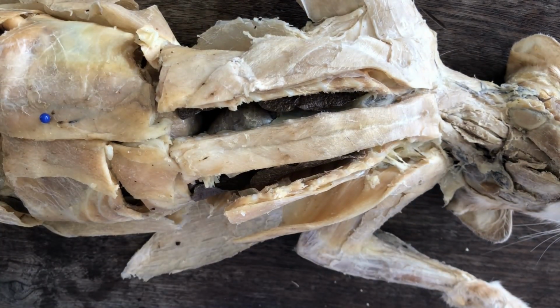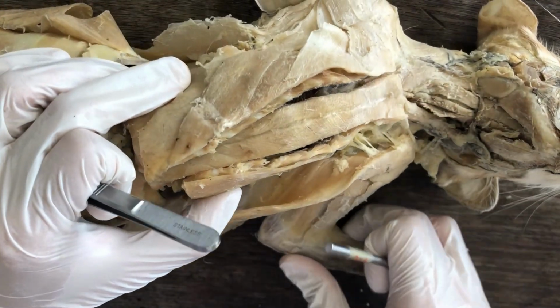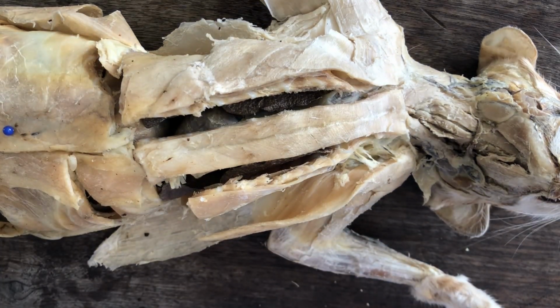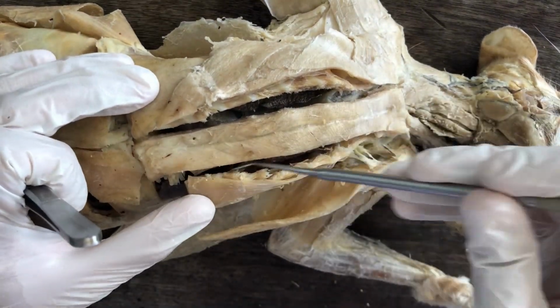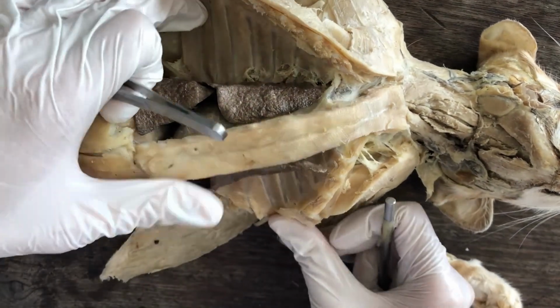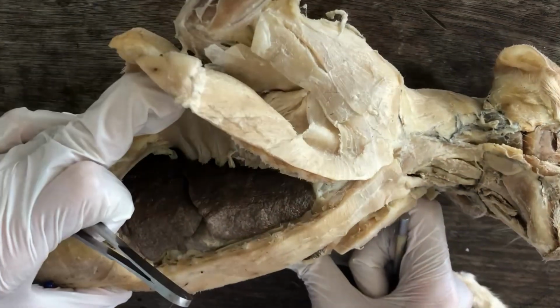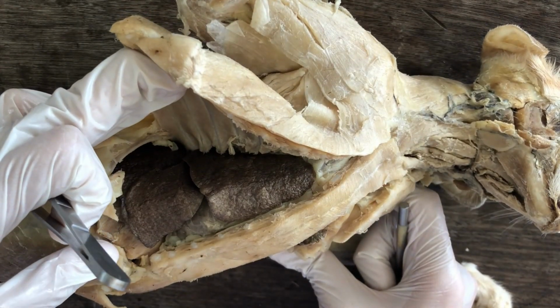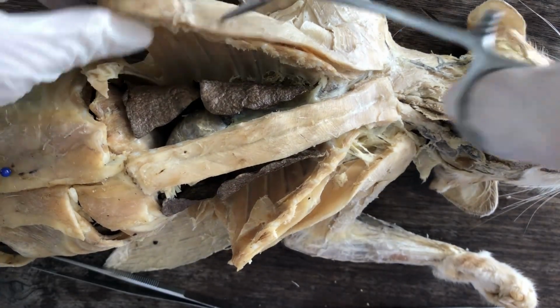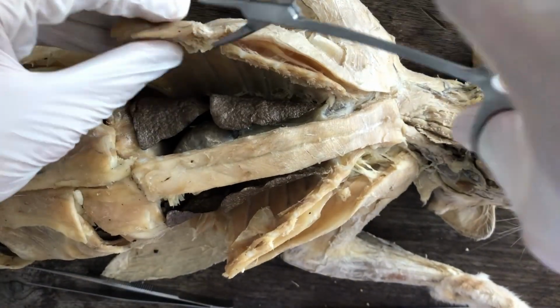This time I'm going to show you the visceral organs contained within the chest cavity or the pleural cavity. And the first thing you have to do is of course to make the incisions, so that you will be able to reflect the rib cage like so and reveal the visceral organs inside, mostly belonging to the respiratory system. So give me a second so I can get the rib cage out of the way.